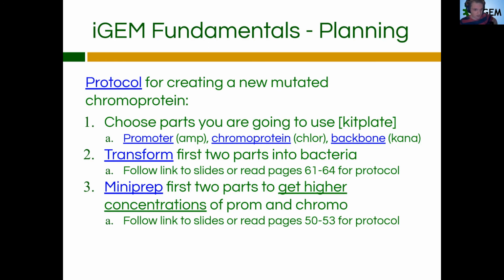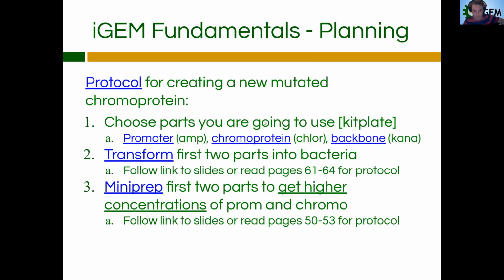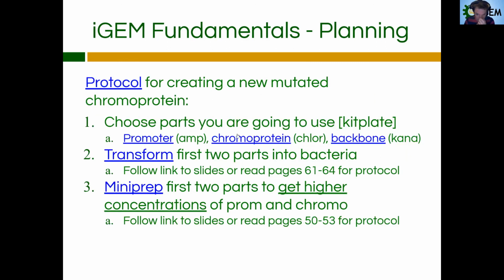So what I thought I'd do is make the general order of protocols that you're going to be doing. I want you to include each of these steps within your outline and include, like I said, what the protocol does and the key ingredients. At first, I want you to determine what parts you're going to be using. Because you're making a new chromoprotein with a different expression, it could be like blue, pink, etc. I want you to include what chromoprotein you're going to be using, also what promoter you're going to be using in order to express that chromoprotein. Because if you just had the chromoprotein in the plasmid, then it's not going to be expressed. It's just going to be sitting there doing nothing. And also your backbone.